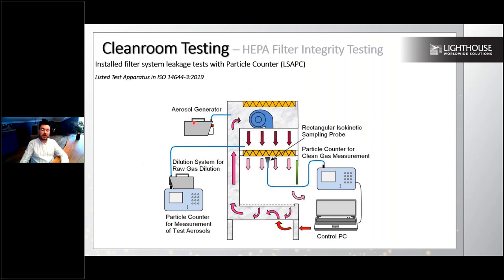Sometimes when you look at an aerosol generator for the particle counter, you see only a few particles coming out of it, and I'm sure you will say, okay, on the other side, the photometer gives us a huge blowout of dust from the aerosol generator, versus a very small aerosol generator with a few particles either seen or not. Don't worry, because particle counters count particles. So making these tests with a certain number of particles is an absolute measurement method. That's not a relative measurement method. That's why this aerosol is enough.